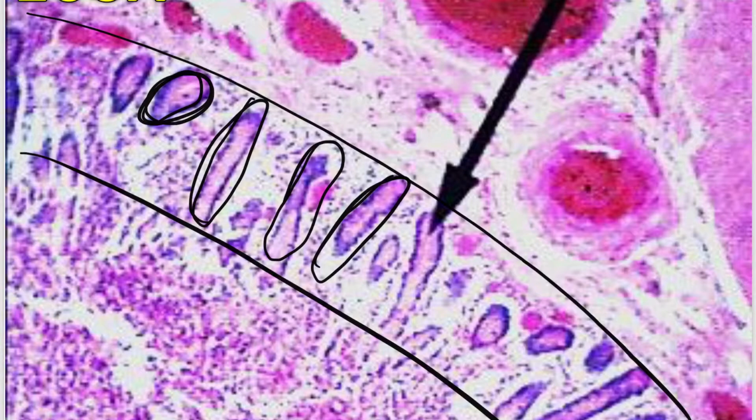Well, the hot dog would just look like a flattened blob. It wouldn't look the shape of a hot dog like you're seeing here. So keep in mind that they're not always going to look perfectly column shaped or perfectly cube shaped, because what you're seeing here is pressed between the glass slide and the cover slip.